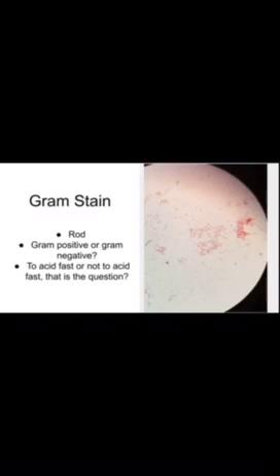I would next need to determine if my unknown was gram-positive or gram-negative. I performed a simple gram stain procedure to help me better understand the type of bacteria I was dealing with. The gram stain procedure proved to be very confusing, however. It seemed as though there were both pink and purple organisms on the slide. Had I already contaminated my specimen, or did I just have poor technique? Or was there something else happening altogether that further testing could explain? The only information that was useful from this procedure was the clear, visible rods shown, but I knew I would need to perform more tests.